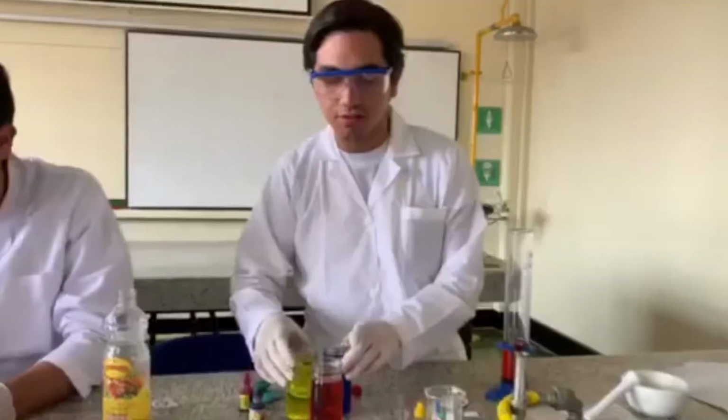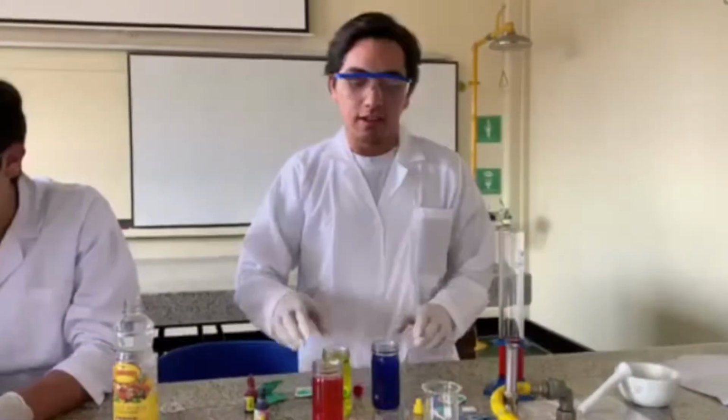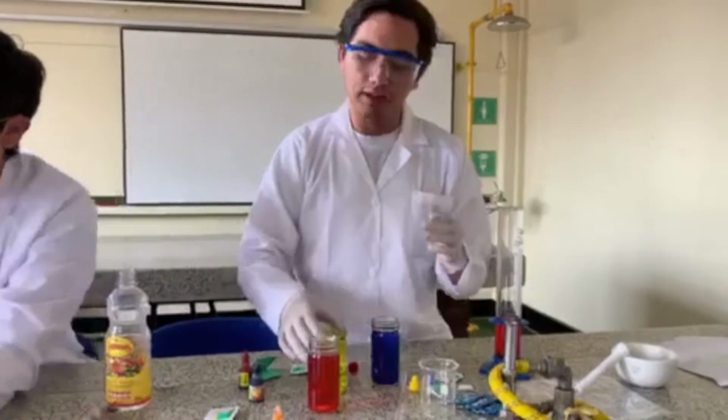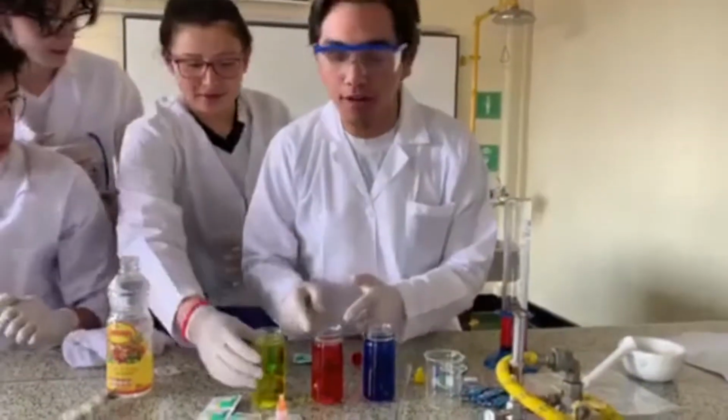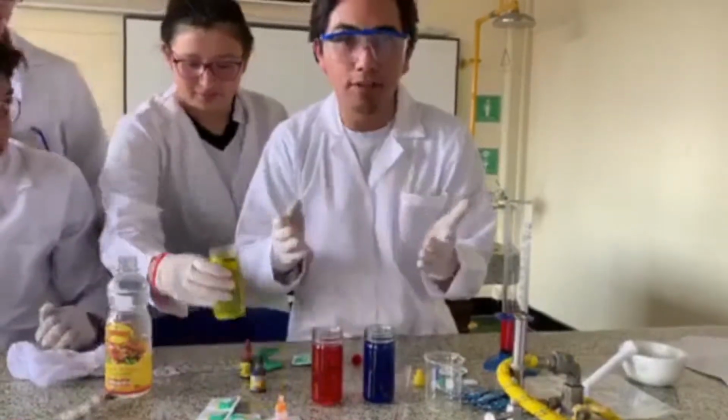What we're gonna do? Well, the first experiment is pretty easy, pretty simple. We have here three beakers. One blue, one red, and one yellow. This one is going to be pretty cold, this one pretty hot, and this one at a middle point.